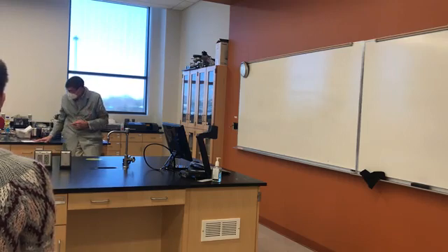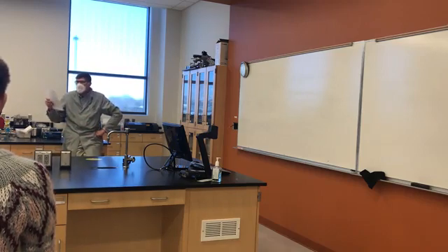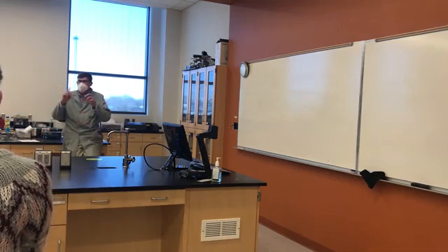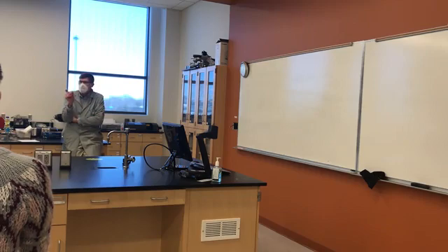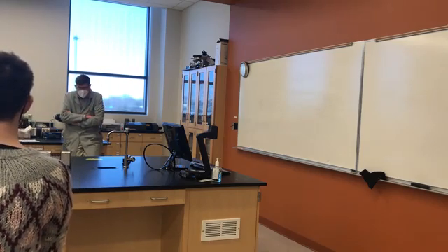And if you look at the handout, specifically, there's one particular absorption band that's involved with the CH bending motion that is unique to fatty acids in the trans conformation. And so we'll see if we can identify differences in the spectra between the soy oil and the partially hydrogenated soy oil using that specific absorption band.